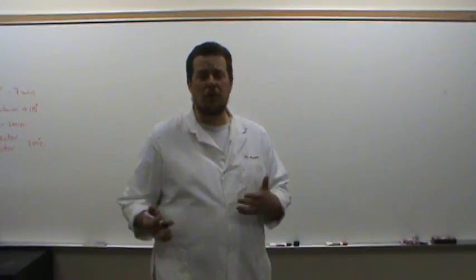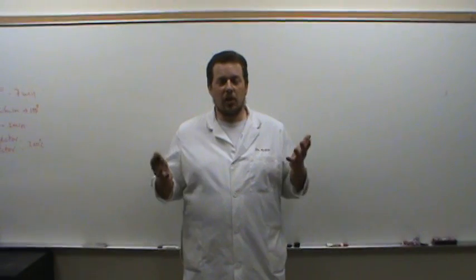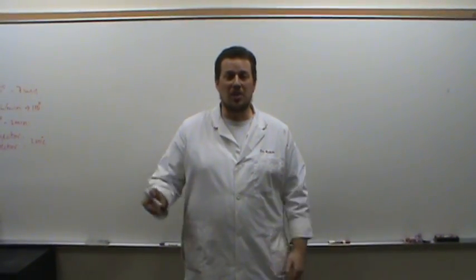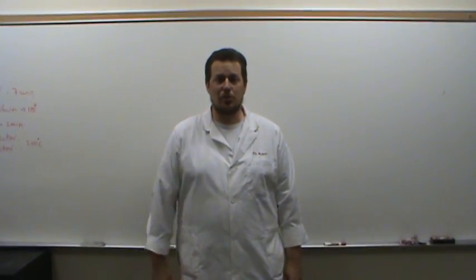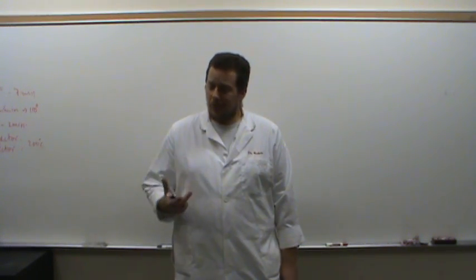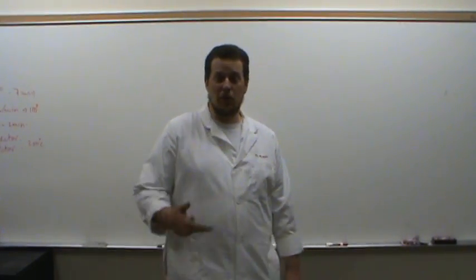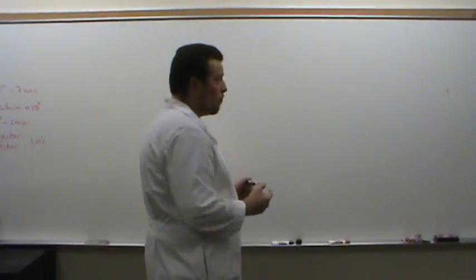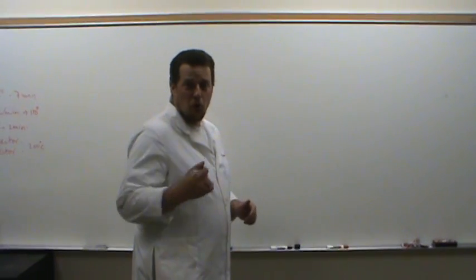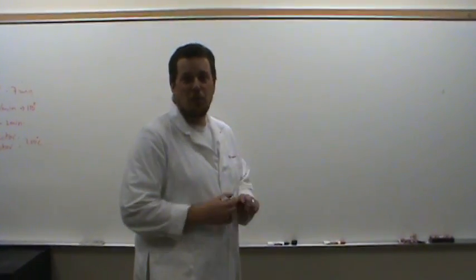The experiment that we're going to be doing this week and next week in lab is really all about how we can use color to determine the concentration of a solution. And the most important tool for us to use is something called Beer's law. Beer's law relates the absorbance of a solution to its concentration and its path length.